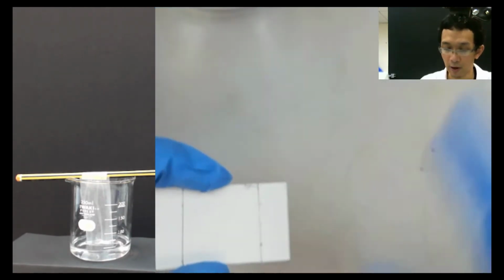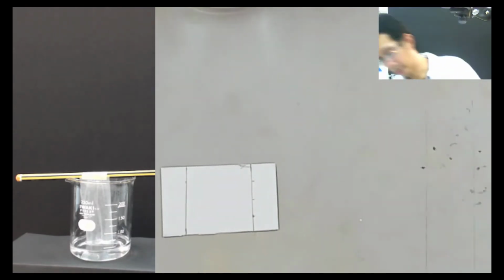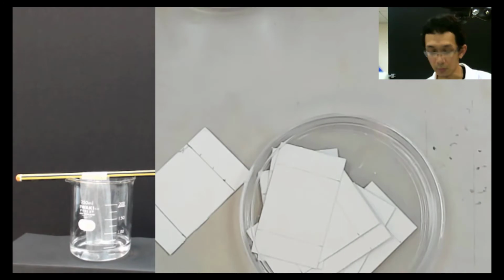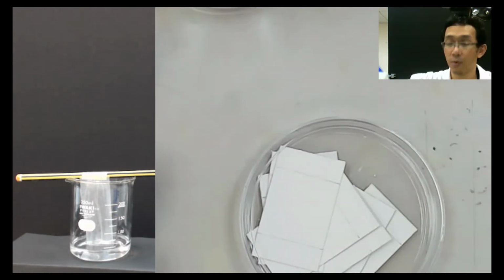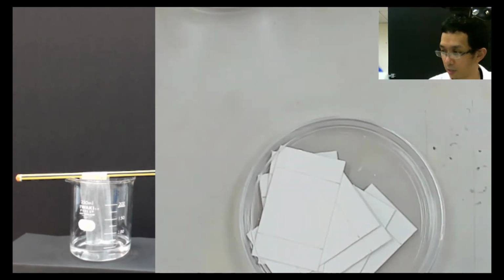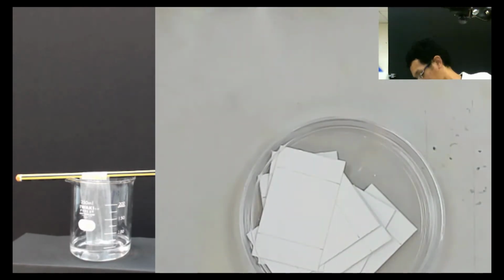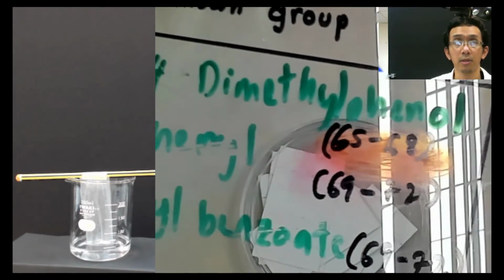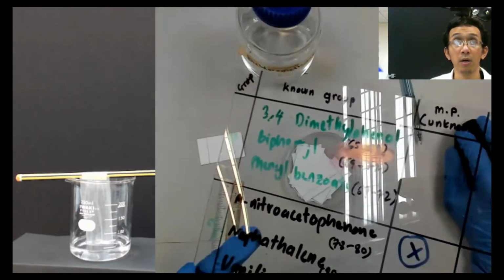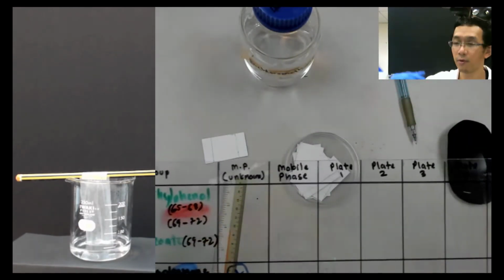And to save time, I already made some of it here, a lot of that. So now what I do is I will put the names, because now we know that we are only interested in certain compounds. We only interested with this thing only. We are only interested in group 2. Oh, this is not. Let me check first. We are only interested in group 2 and group 3. So we just remove whatever is not needed.